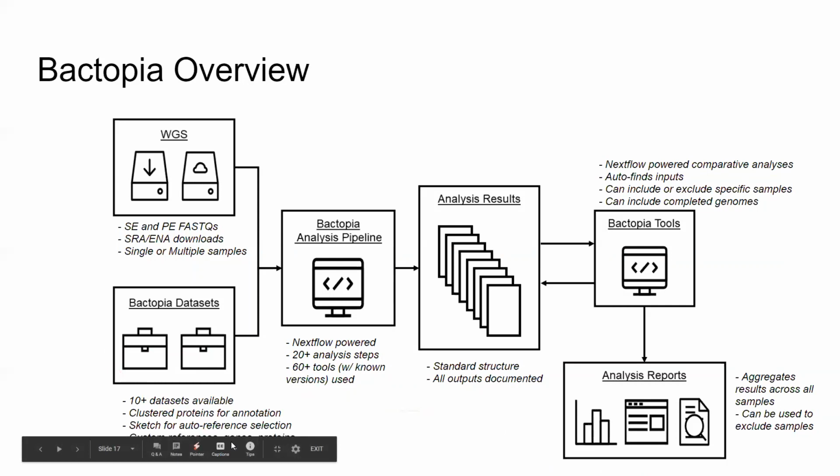And the user can provide their own reference genomes and their own genes and proteins that they may want to have blasted or call variants against, or just have reads mapped against. So for example, if you're interested in a specific gene and you're curious, does it actually have coverage? And if it does, is it uniform coverage, or is it something where I need this particular region of the gene, and when I do my coverage plot, oh, that gene's missing, stuff like that.